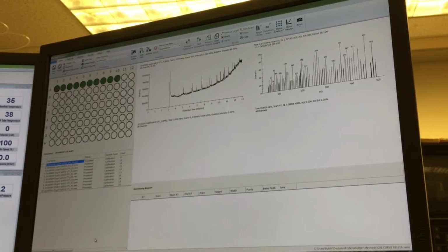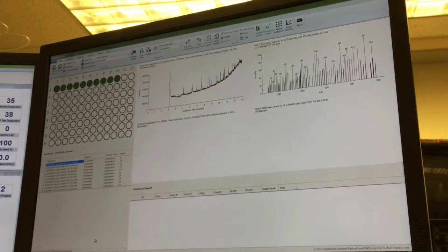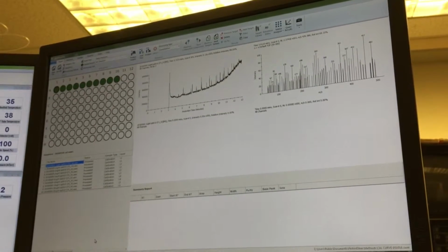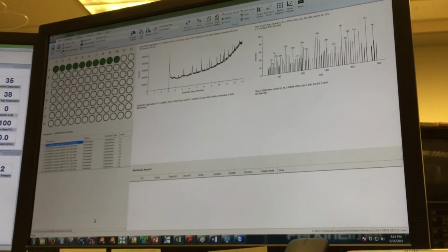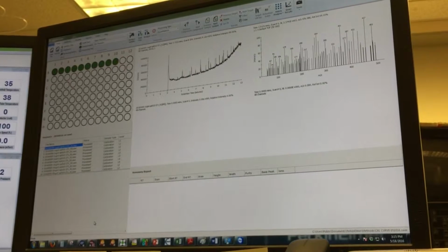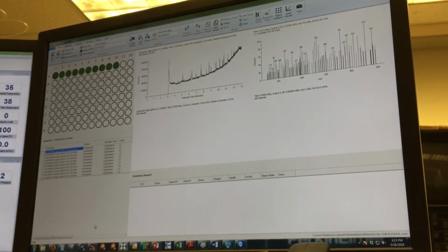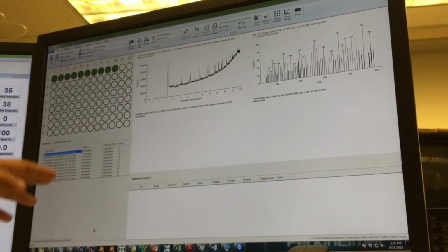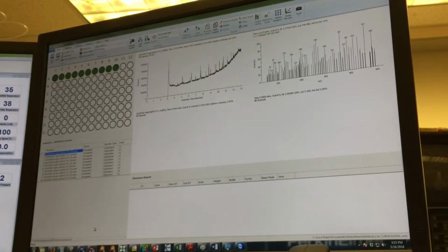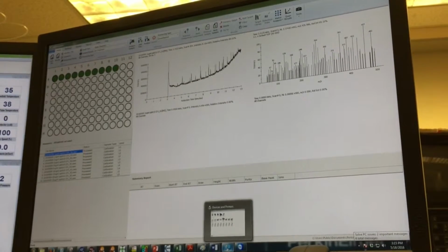But in this case I wanted to show you a shortcut, but see, it's always important that if you have more replicates, it will give you good repeatability. And if you see one point is off, then the 2 point, you can delete that point. But I thought it will give, but now I realize that it's better to choose more points, because here I chose fewer points than my results. So maybe now I can choose all of my results, then I think I will get a better result. But this is the way I'm just showing how to build the calibration curve.